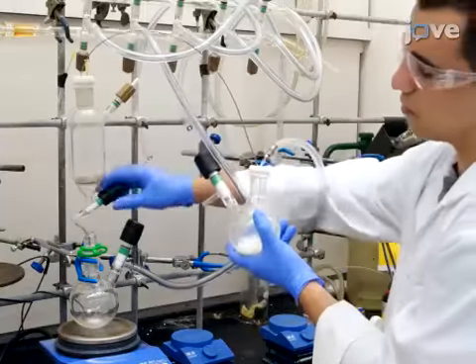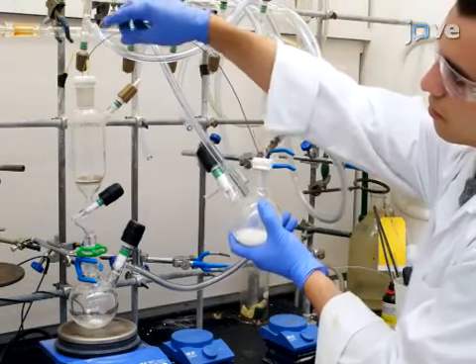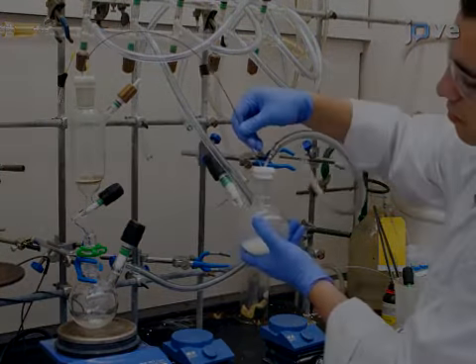After stirring is complete, filter the reaction mixture through a fritted flask topped with a 1-inch thick silica plug to remove the precipitate.